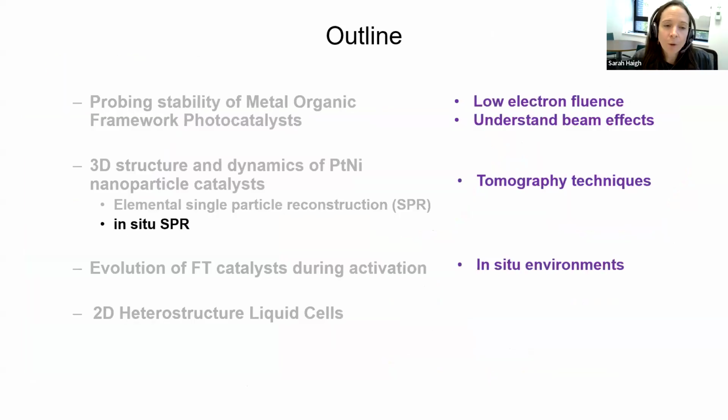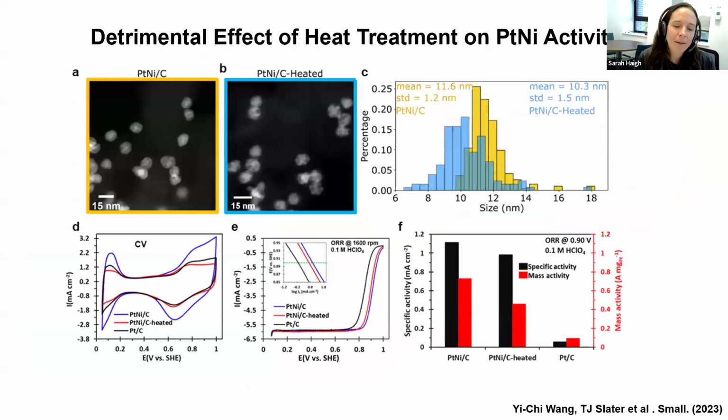So we were interested in understanding this, but of course the platinum nickel nanoparticle isn't used in a vacuum, it is used inside a fuel cell. And so Gerard came back a year or so later and said, that's great, Sarah, but when we put the platinum nickel nanoparticles into our fuel cells, they stop working relatively quickly, and they go back to being only as active as the conventional platinum on carbon electrode. So can we understand what's happening, why these platinum nickel nanoparticles are falling apart?